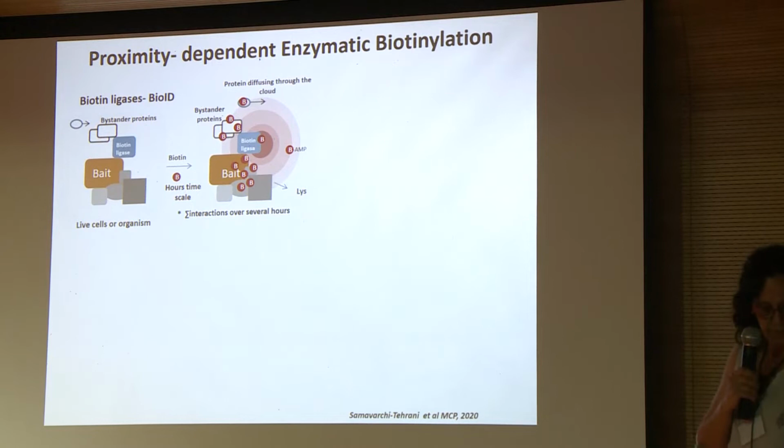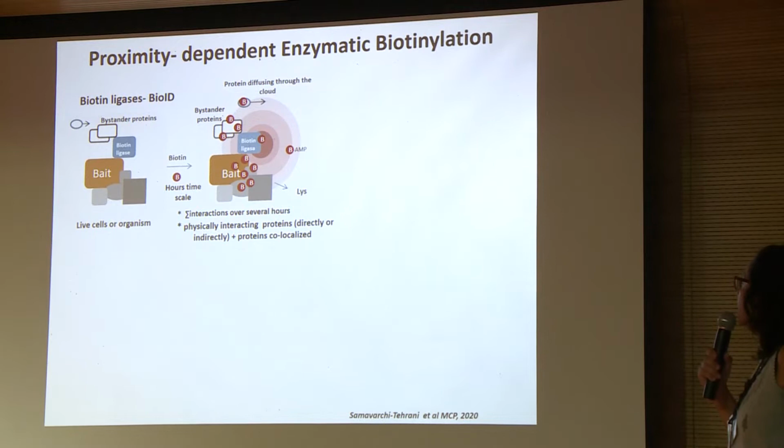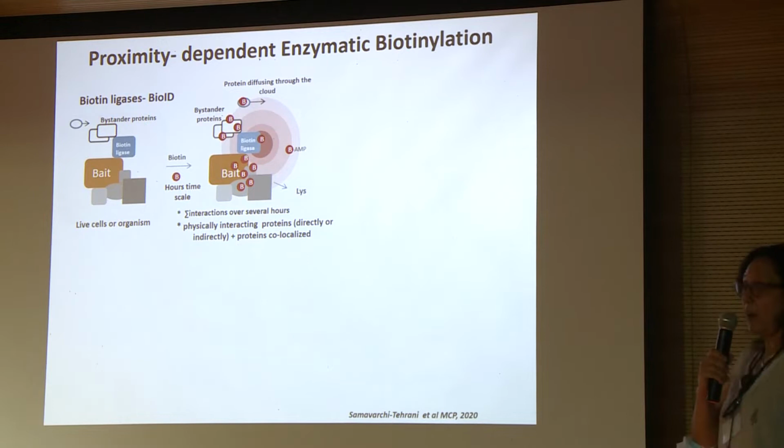So at the end, we will have a sum of all the interactions that have taken place during these hours, and these are either physical interactors or proteins that co-localize with our bait.